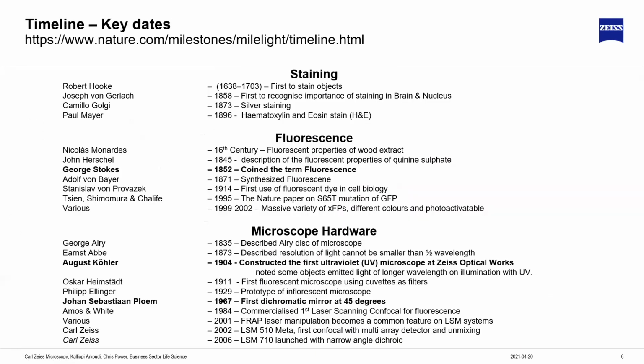Now this slide, I'll admit, is a little busy. I'm not going to read out all the names on this slide, but what I wanted to talk through was some of the evolution that led us to the spectral systems we have today. And I will point out, Nature has an incredibly good series of pages I linked to at the top here, which talk you through the history and evolution. I only include a subset on this slide.